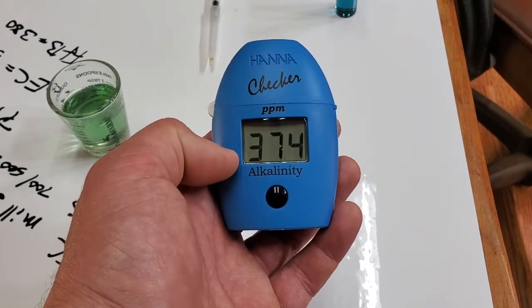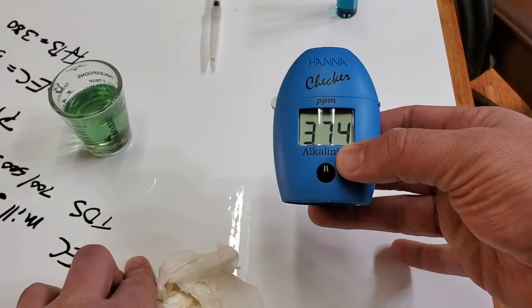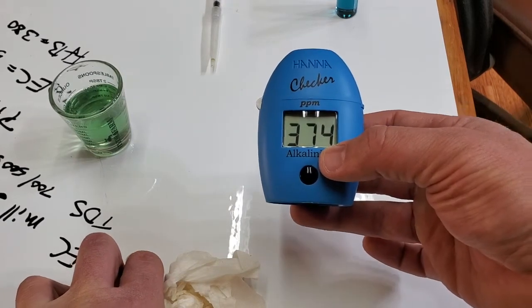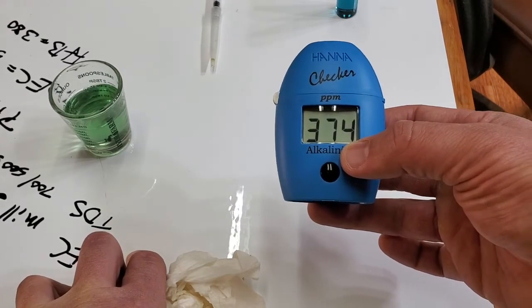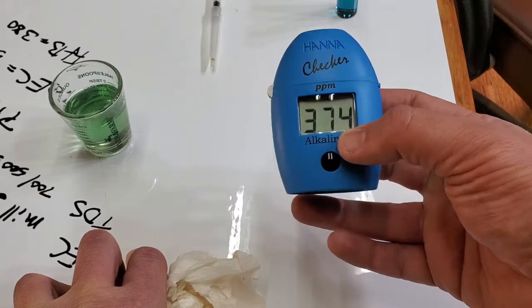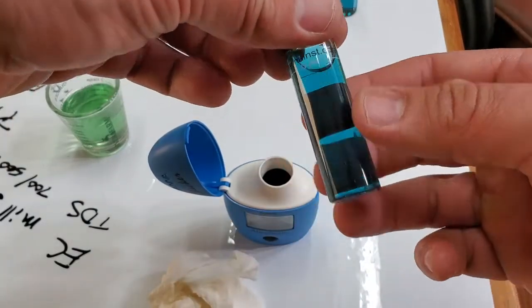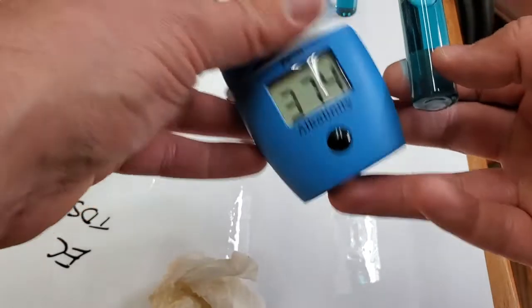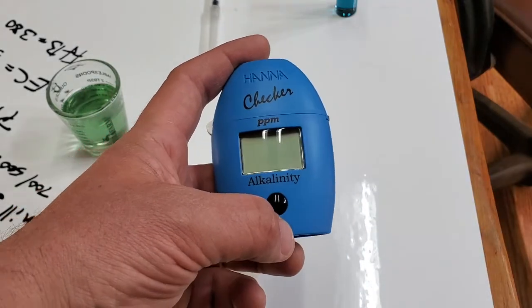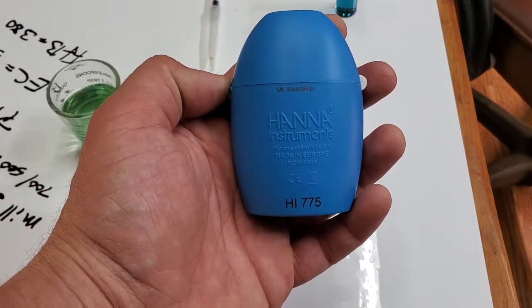If you're using municipal water and you saw it shift from 125 to 375 within two weeks, you'd know your source water changed and you need to modify your nutrients and pH adjustment accordingly. It's a neat little tool with that science kit reagent thing — takes you back to school. It's got a lot of value in the hydroponic and plant growing world. It's the HI-775.